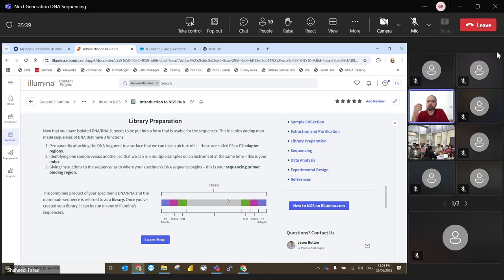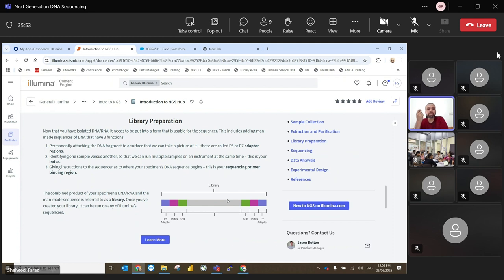But there are still very efficient enzymes that are very commonly used in sequencing, because for sonication, if you are a lab manager, you also have to think about the cost. If you want to break by sonication, you need a sonicator, right? But if you want to break by enzyme, you actually need nothing. You will just pipette the enzyme in the PCR plate and it will digest the DNA.